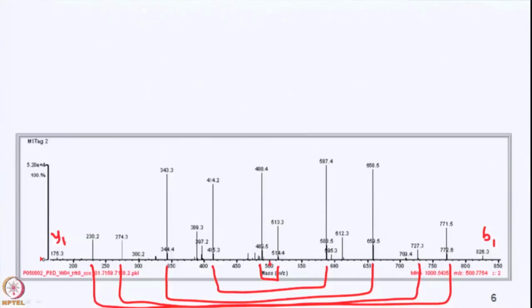You're going to have multiply charged things. There's going to be internal ion fragmentation. You usually have a cleaner spectrum up at high mass. So now let's just do some arithmetic. This mass gap here is 101. No, 58, 13, 71. This mass gap here is 113.